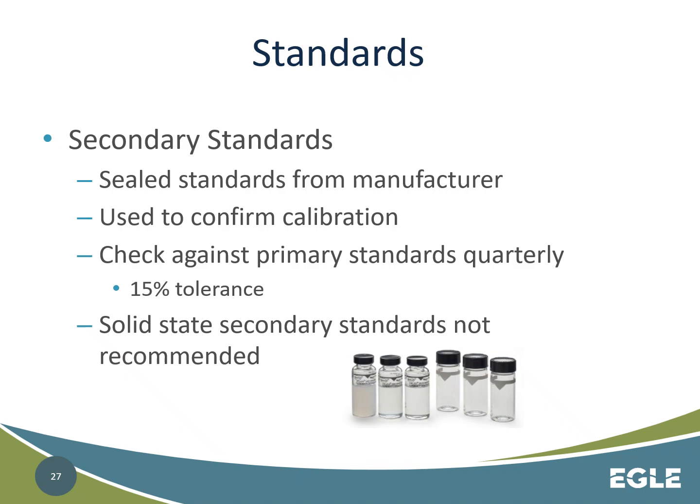There are some that have solid state secondary standards, like a glass rod, but we typically don't recommend them because it doesn't take much to throw the calibration off using that glass rod. So it depends on your manufacturer, but every manufacturer is going to have secondary standards that are used on a daily basis, at least twice a day, if not more, to check calibration before you're taking your every 4-hour sample and calibrating, or to make sure that it's within standard rate. So that's kind of what you're looking at with turbidity.